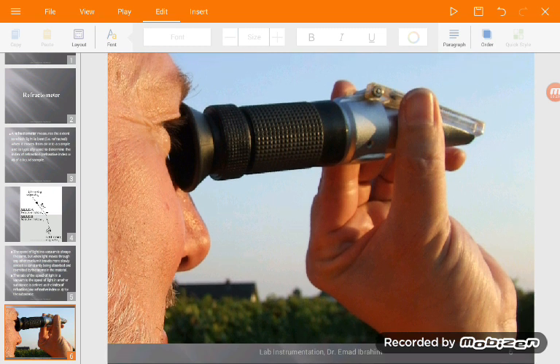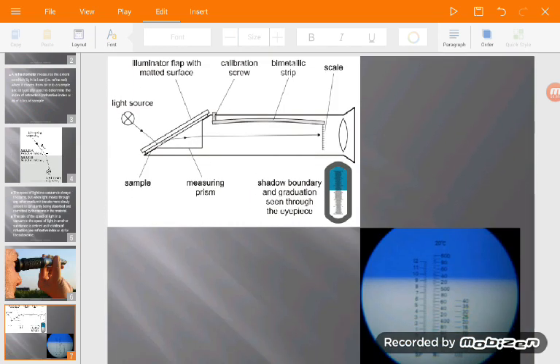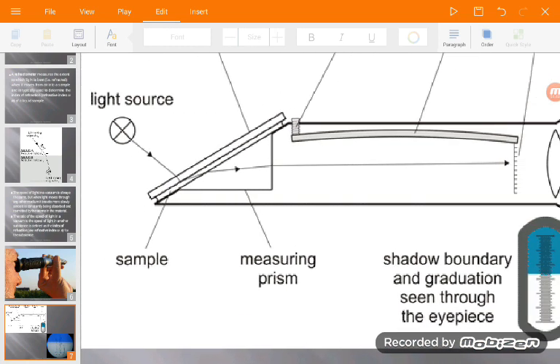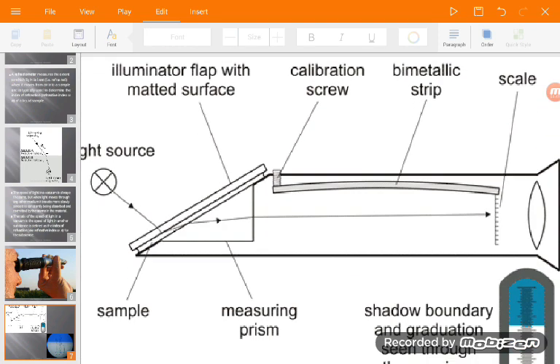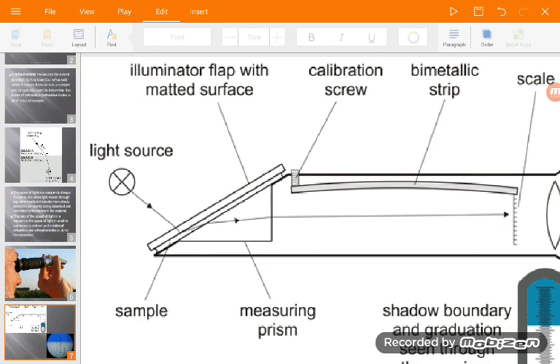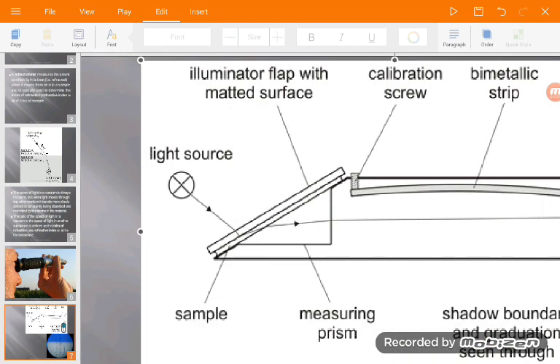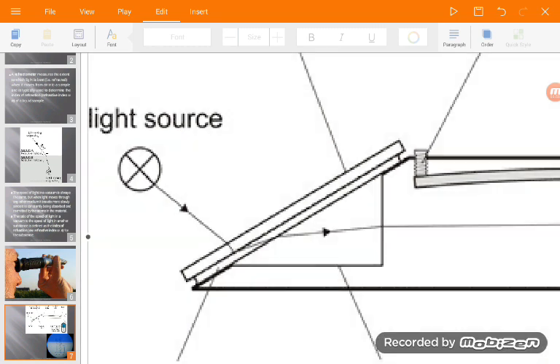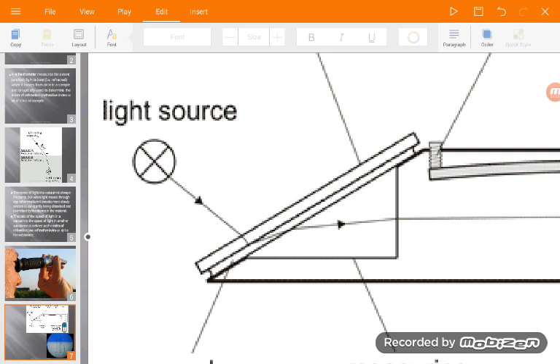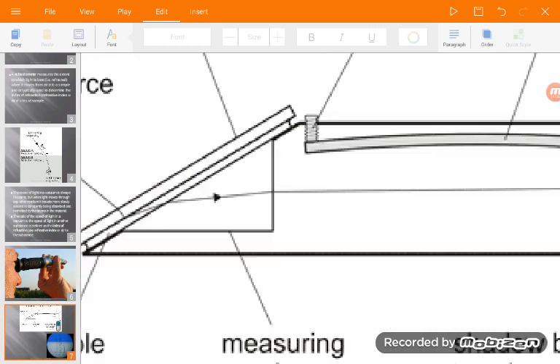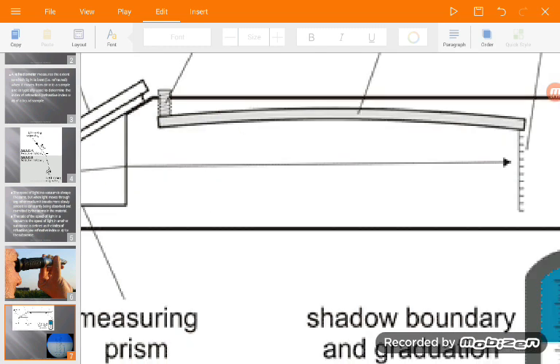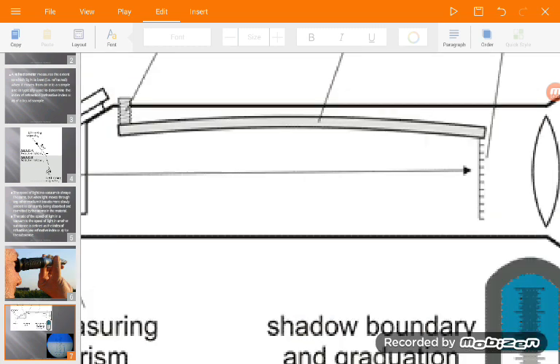Now we will see how the refractometer works. We can open the sample area here — we open this flap and put the sample. Then the light will go through the sample. According to the refractive index of the sample, the light will be bent. This is the line of the light entering, and this is the line of the light going through the refractometer, showing the refraction according to the refractive index of the substance. This will be reflected into a meter.